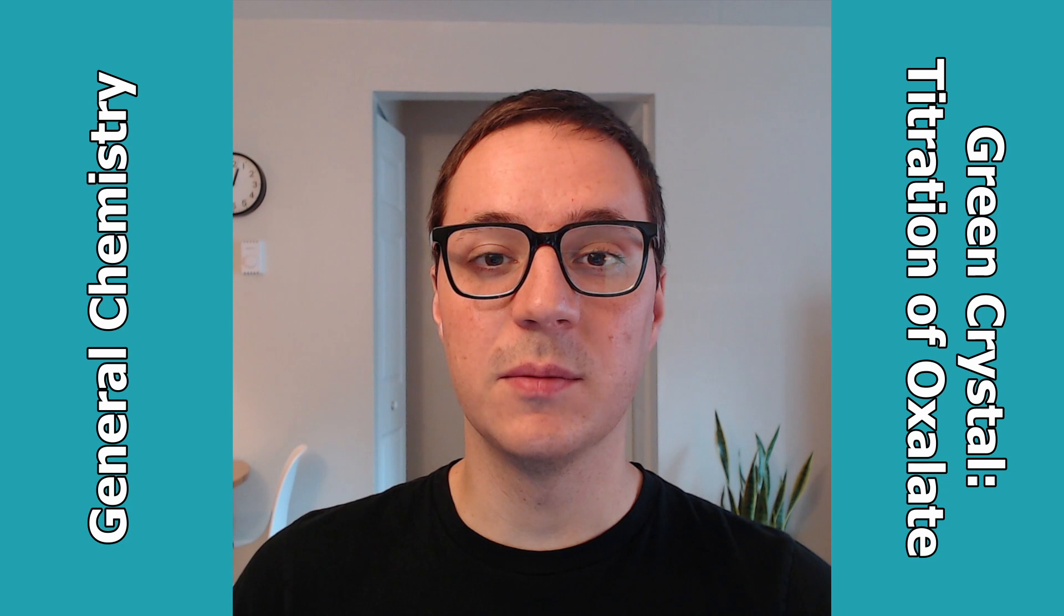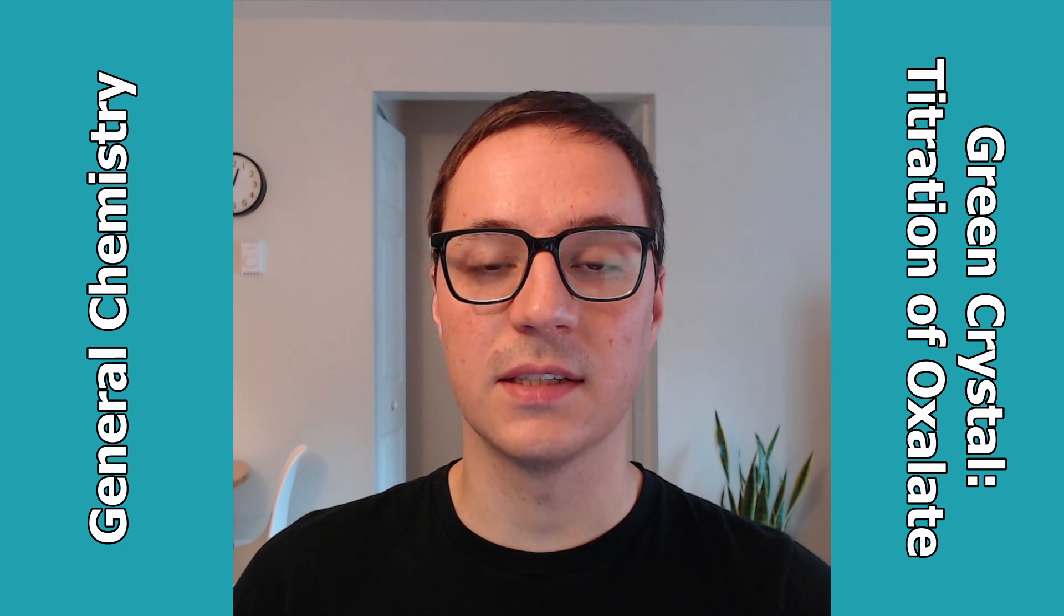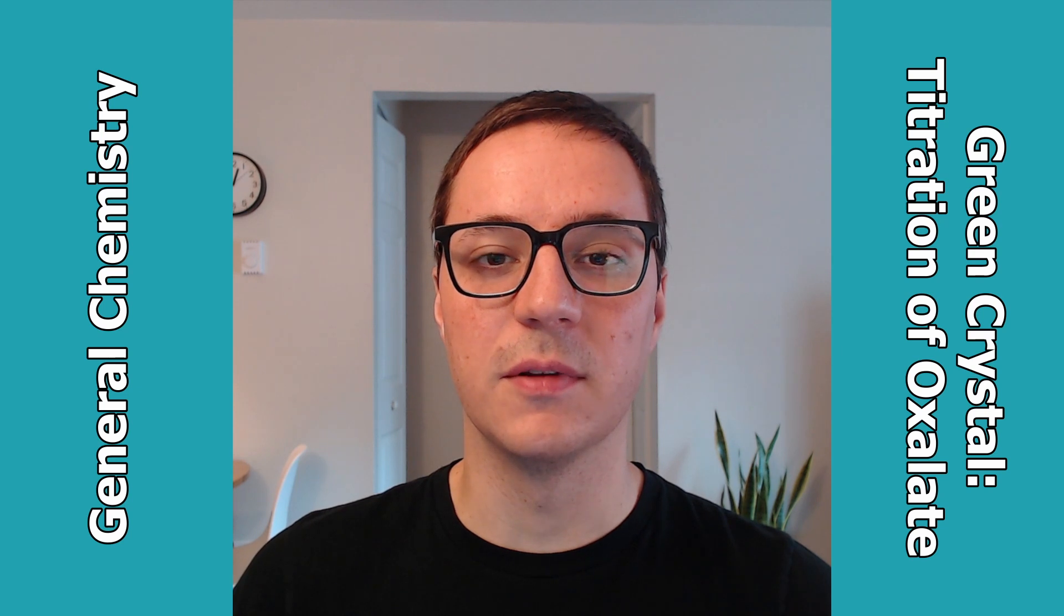It's up to you to do a similar calculation for iron and oxalate in the green crystals. Just keep in mind the full formula of the green crystals, including those three water molecules.